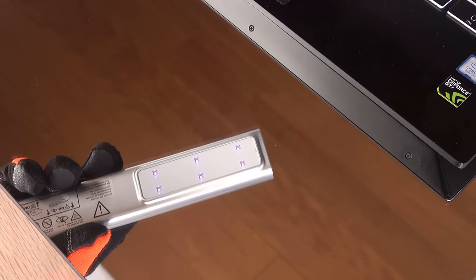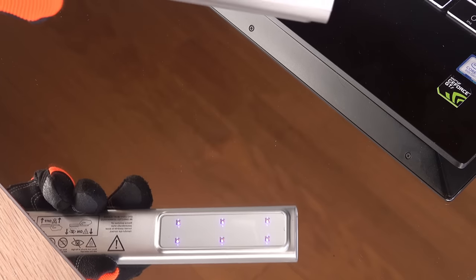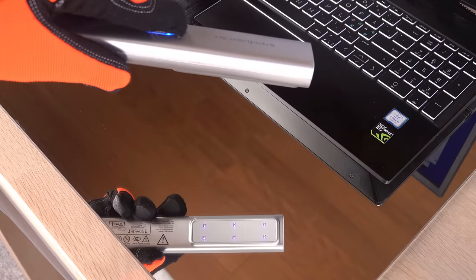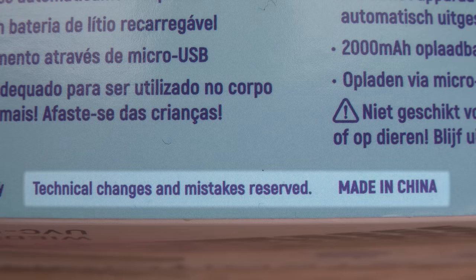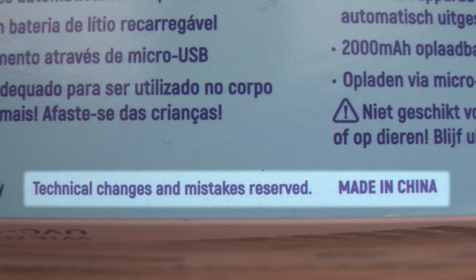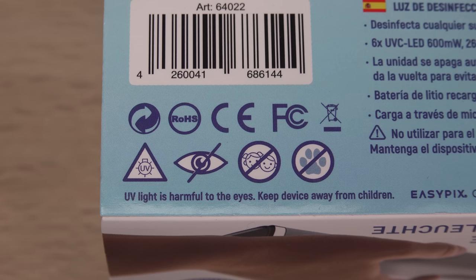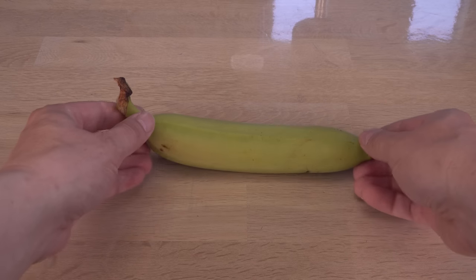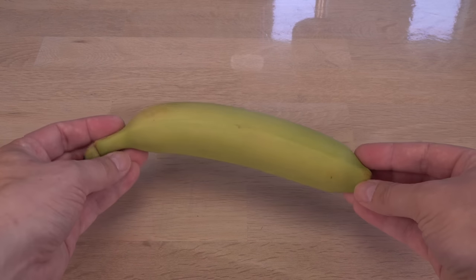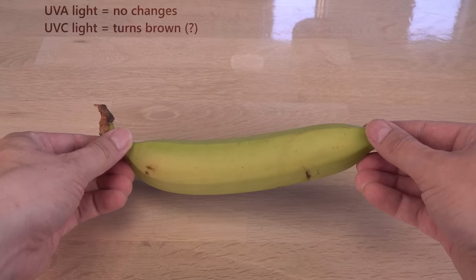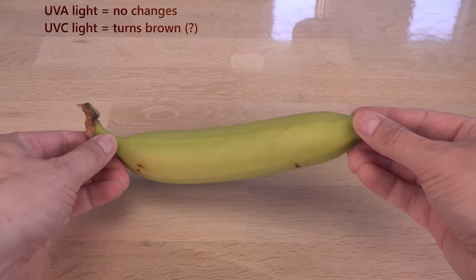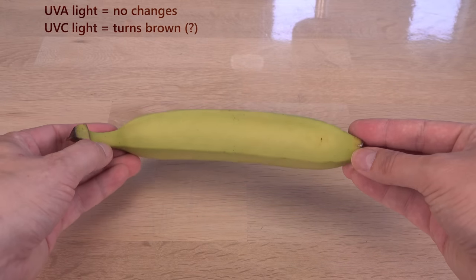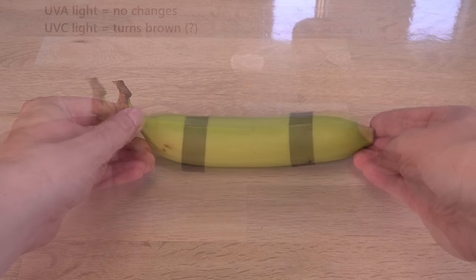To me, it looks like weak 405 nanometers. Is it really emitting UVC? Apparently, there is a simple indicator for UVC light: a green banana. It should change color under UVC, but not under UVA light.